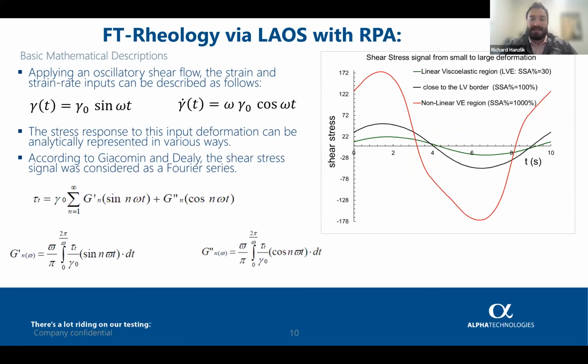So the most common analysis approach or technique used to apply the LAOS characterization is Fourier transform rheology, or what we call FT-Rheology. The FT-Rheology technique was developed several years ago by Deely and Giacomin in 1992 to characterize the nonlinear viscoelastic behavior of complex fluids, mainly soft polymers.